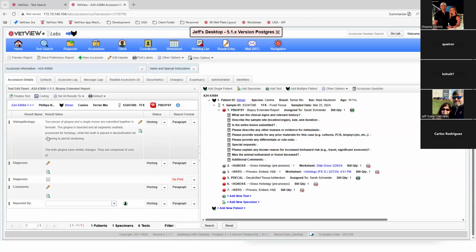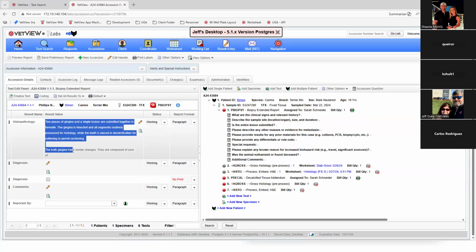And depending on the data type, you get different options. So for a biopsy, we've got it set up for rich text and plain text here. Or actually, all these are rich text. With rich text specifically, when you first come into the test, it's in a read-only state. So if you want to read through it, it's a little easier to read there. You don't have to click in and out of little boxes to potentially find the data.